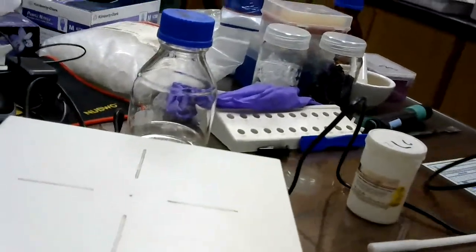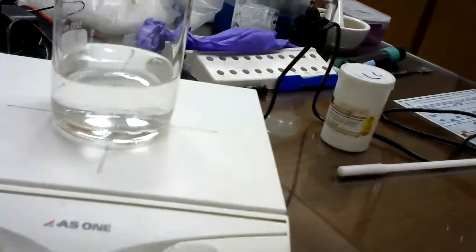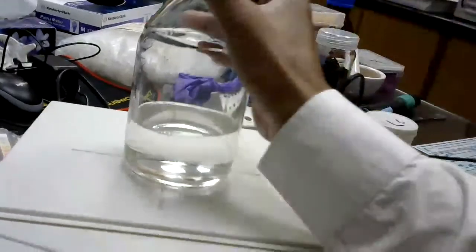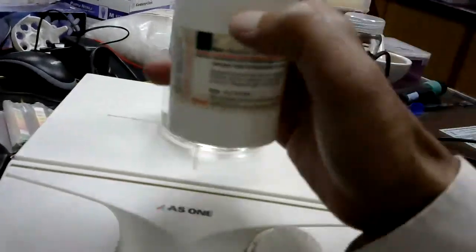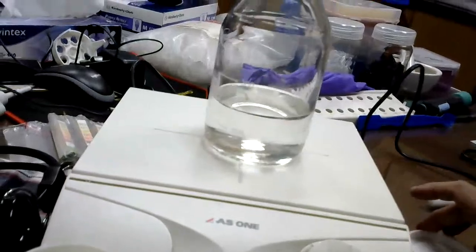You have to keep the solution here, and of course, it should be open. And you need some magnetic bits to stir it. This is a magnetic stirrer, and then you require magnetic bits.